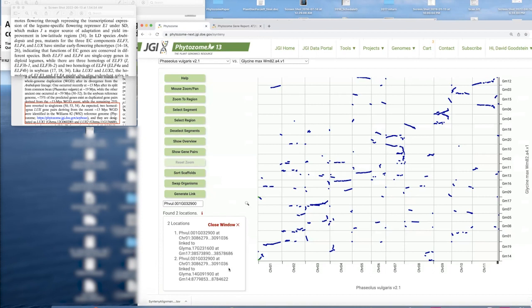actually, if you look in chromosome 1 of Phaseolus, to soybean chromosome 4, which is here, there is absolutely no synteny at all. Not with my gene of interest, not with any genes. So this is a case where there's been enough scrambling that any syntenic signal, if it was there, is not there any longer.